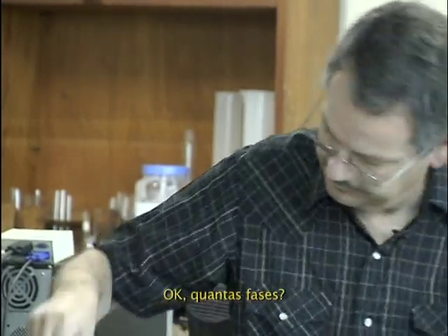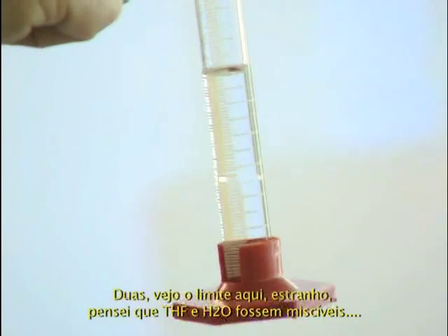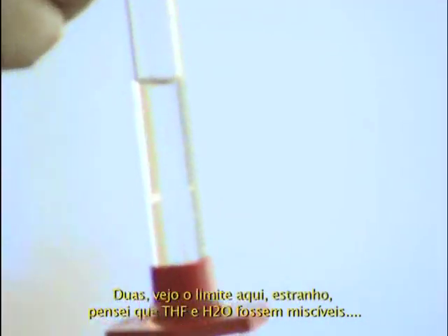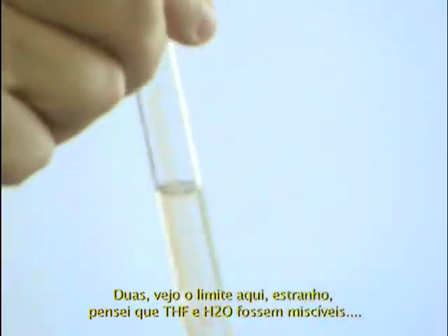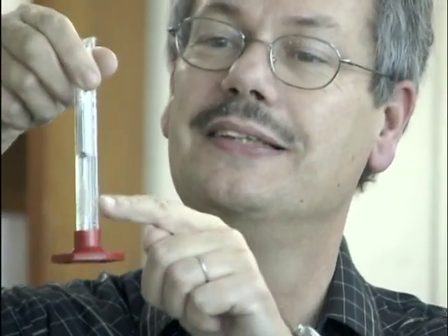Okay. How many phases? 2. I see the limit here. Strange. I thought THF and water were miscible. There are 2 phases. But if I check it, it disappears.